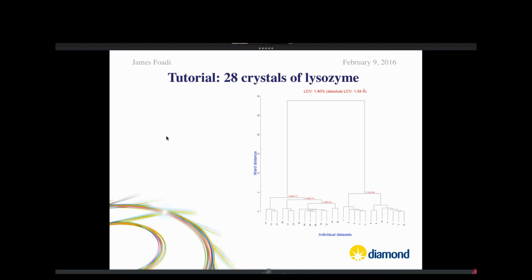The dendrogram shows very clearly two branches corresponding to the two different groups with which we assembled the original group of data. At this point, we would like to create scaled and merged data for some of the nodes of the dendrogram by executing Blend in synthesis mode. This can be done by selecting an appropriate height below which are included all nodes that need to be processed. It is good practice to calculate scaled data for all clusters of the dendrogram.